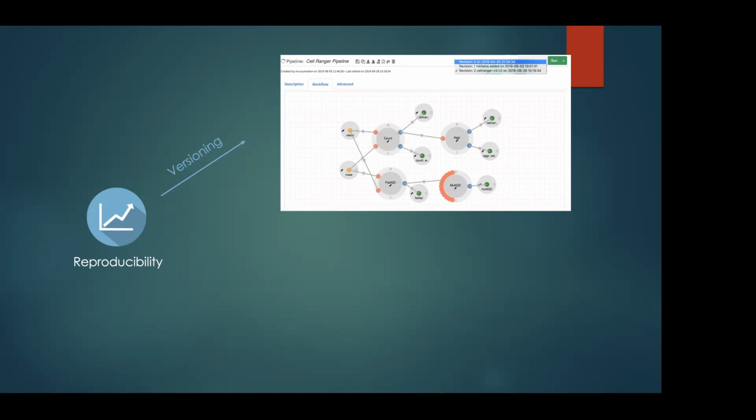For example, it happened a week ago that one of our collaborators ran everything 3 years ago with TopHat. And he wanted to run everything with STAR. So it's the same pipeline. We just changed the revision, changed TopHat to STAR, and then got the results without doing anything. The files were already there in the cluster. And we upgraded the annotation files that he used.